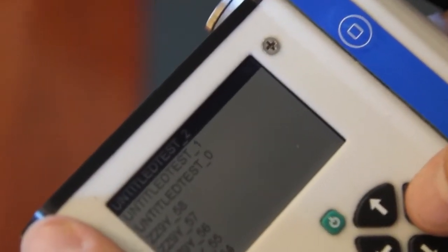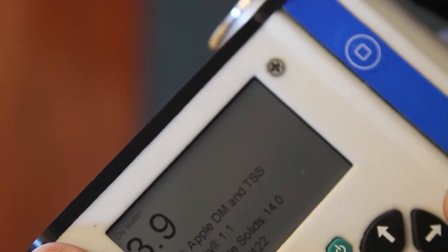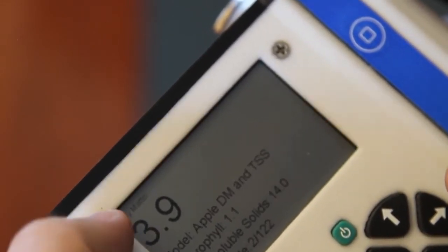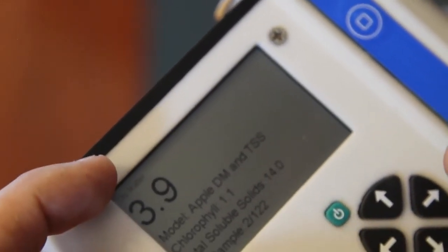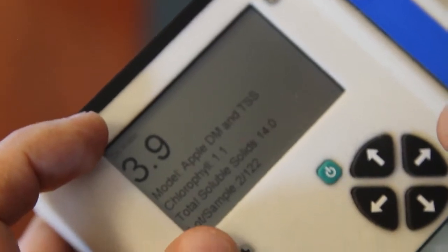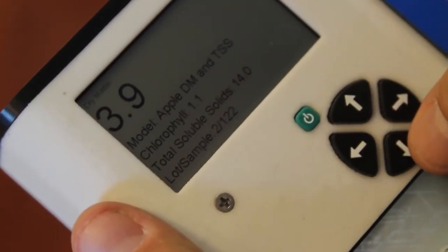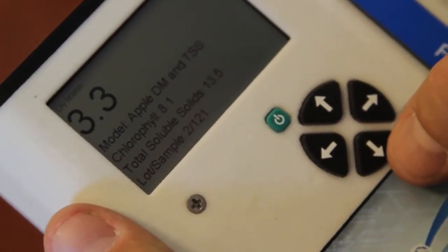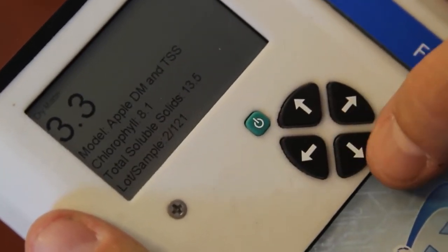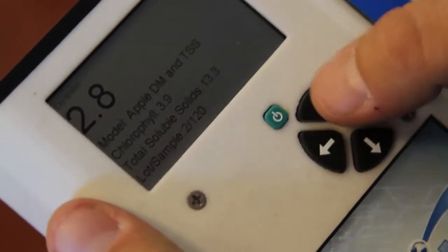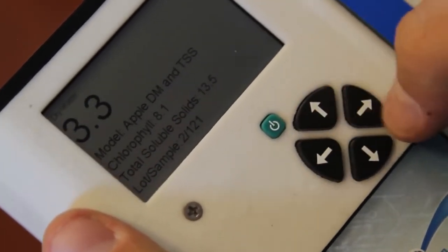If we scroll to the right, we're shown the same data summary screen for that record. Here we can actually press down to scroll to the next record, or up to scroll to the previous.